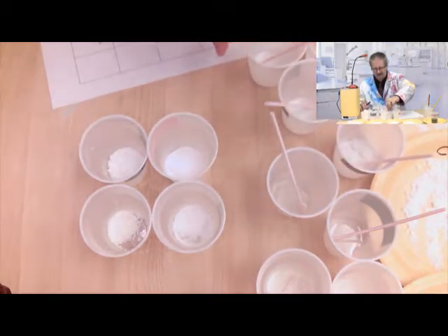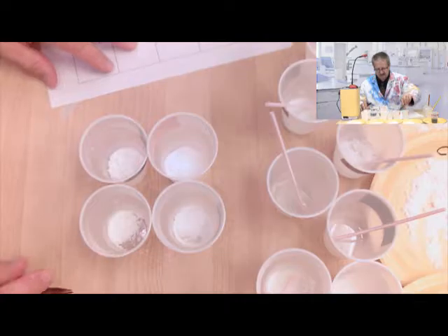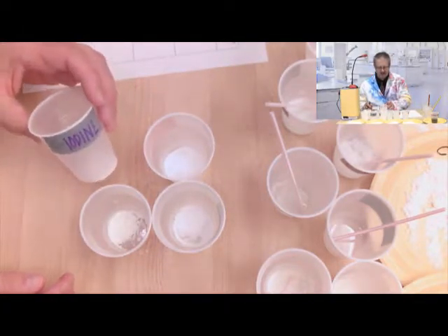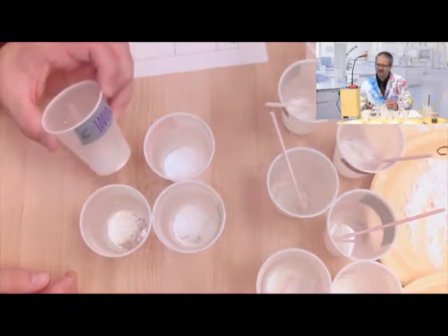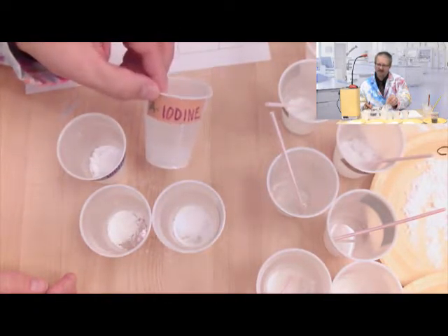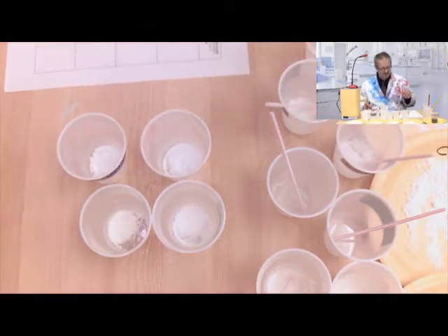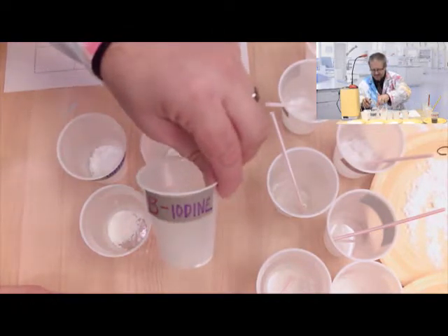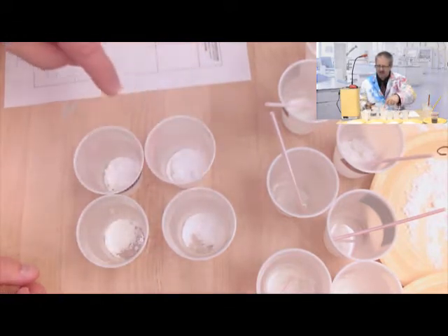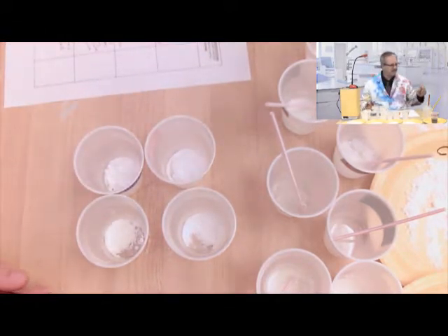Don't want to knock anything over. Okay. So our last four, these are all of my iodine. This is labeled A, iodine, so we know which powder is which. So A is here, B is here. So we're going to go A, B, C, D.